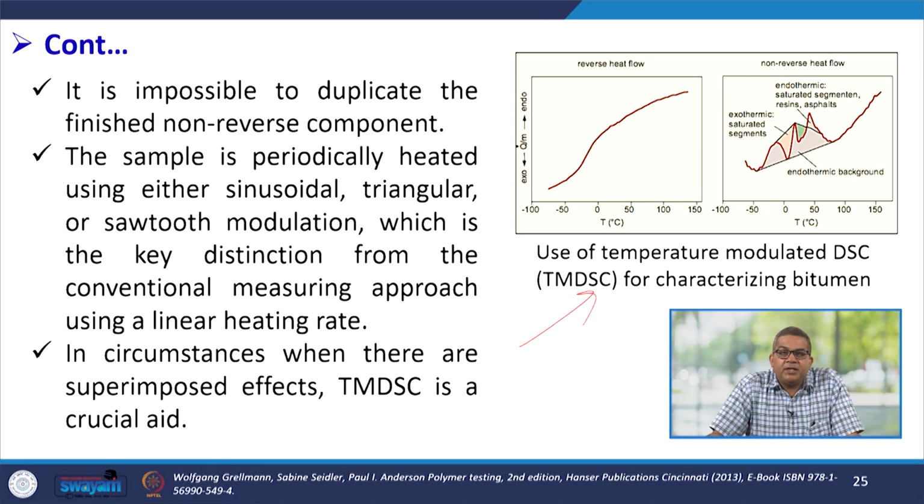The sample is periodically heated using either sinusoidal, triangular, or sawtooth modulation, which is the key distinction from the conventional measuring approach using a linear heating rate. In circumstances where there are superimposed effects, the TMDSC is a crucial aid.